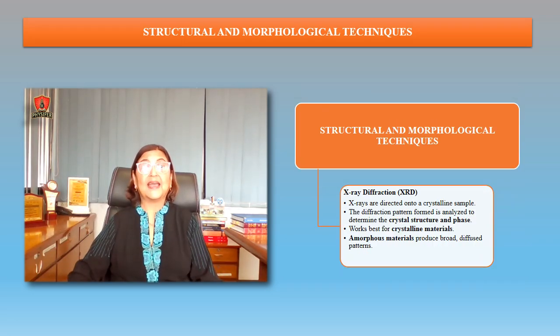Fourth is X-ray diffraction, XRD. It gives information about crystal structure. The X-rays are allowed to fall on the crystal and the analysis of the diffraction pattern obtained gives the crystal structure. It only works well for crystalline materials.